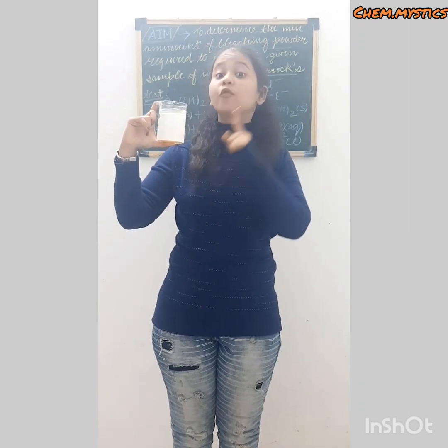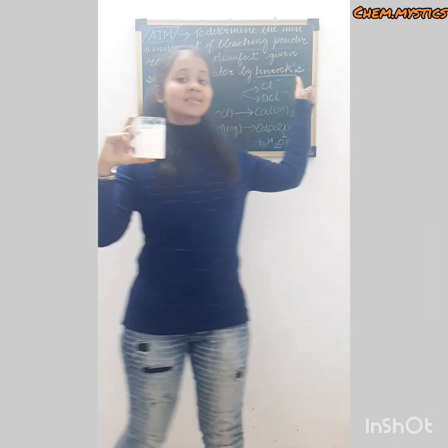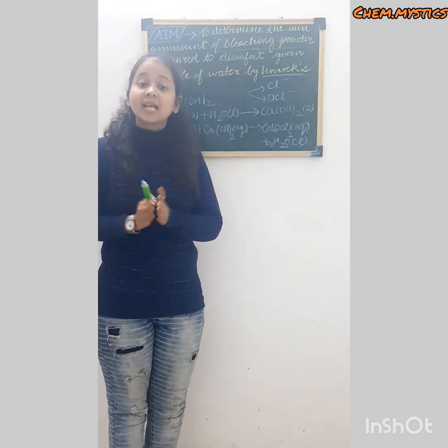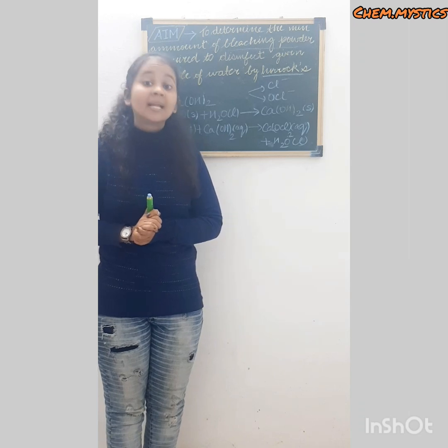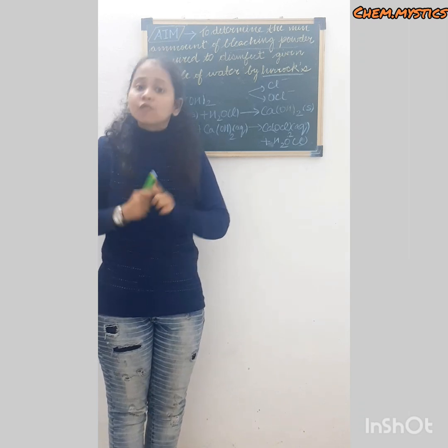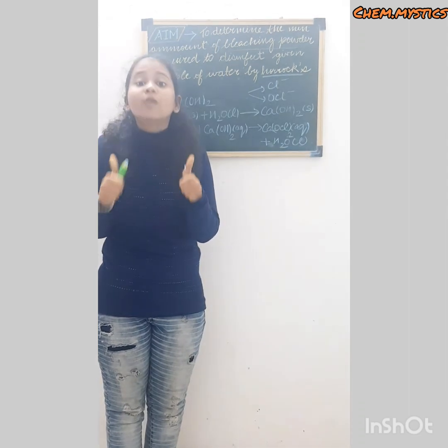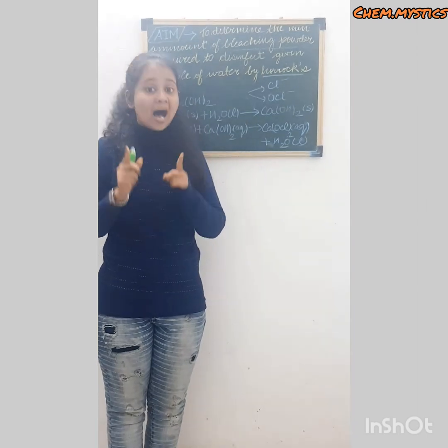So can you people tell me how much minimum amount of bleaching powder I should add in it so that my disinfection can be effective? Yes or no? No. So to find out the minimum amount of bleaching powder that is required for effective disinfection, Horrock's test is performed. So I just hope that you have got my point now. Now, think to yourself guys, why are we detecting the minimum amount of bleaching powder? Think. Listen guys, if disinfection can be effective by adding a minimum amount of bleaching powder, then it is very good. Why add more bleaching powder? Are you getting my point?